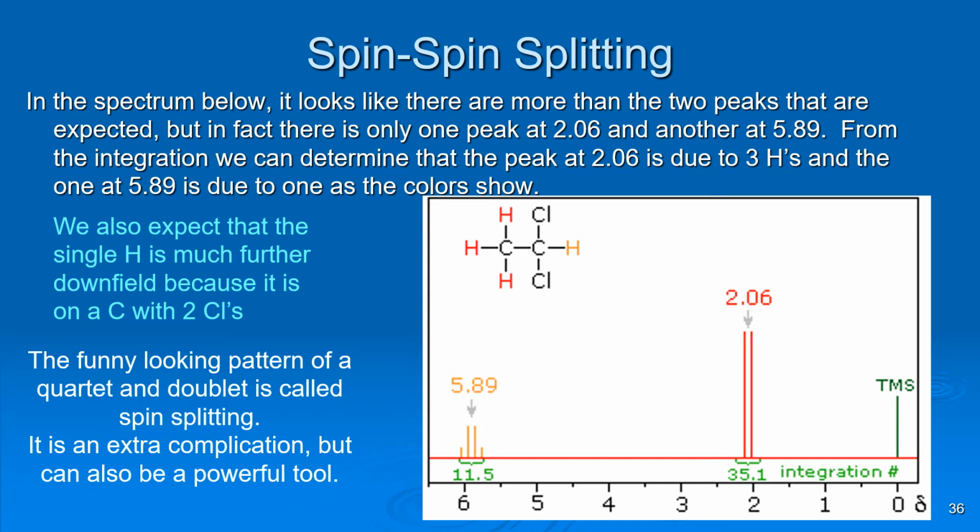So there's one more topic that has to do with NMR, which actually gets a little bit complicated. However, it's also very powerful and very useful. So it's a really good thing to learn and to try to focus on. So look at the spectrum that's on this page.